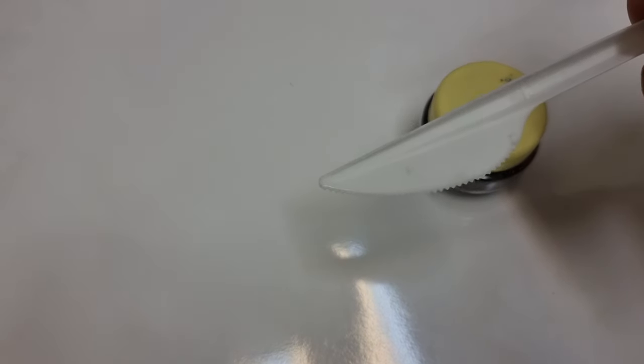Now, I have some plasticized card in the background here, and I'm going to use this little knife here to take some of the sample and put it on here, and we are going to use that same neodymium magnet placed underneath, and we will see if we can move some of this around to see if it's ferromagnetic. So if there was iron or nickel or cobalt or gadolinium in there, you could potentially see it move around. Well, we're going to find out.